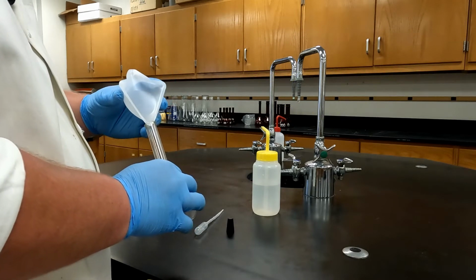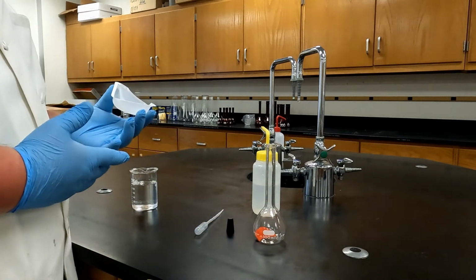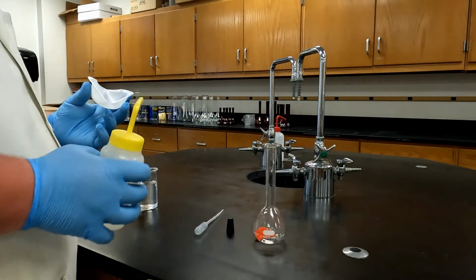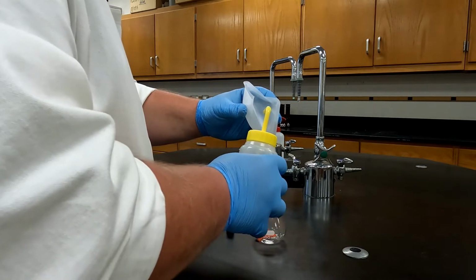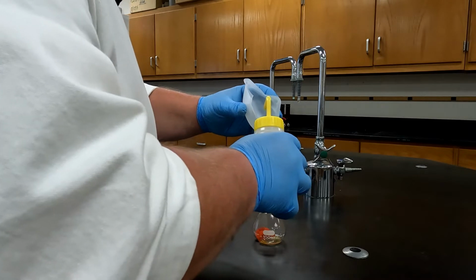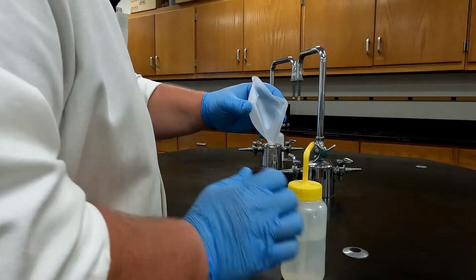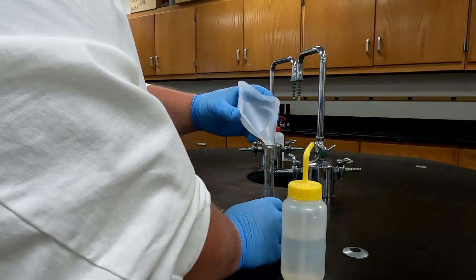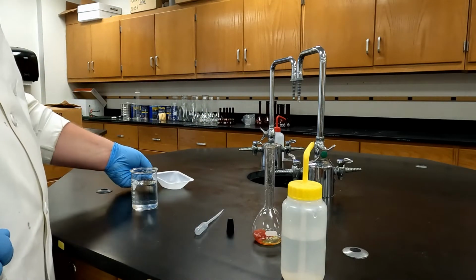Once I've got everything that's not stuck, there are actually two different options. I can either remeasure the mass of my weighing boat to figure out how much went in, or the second option is to, again, gently spray a little bit of water into my weighing boat using my wash bottle. Tap it a couple times and make sure that all of my chemical has been washed into the flask.